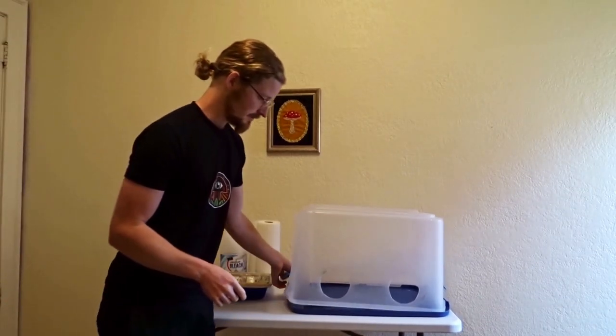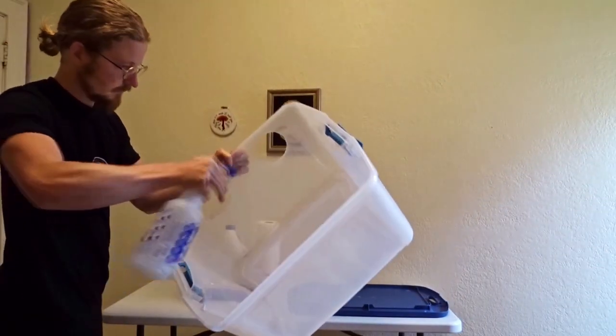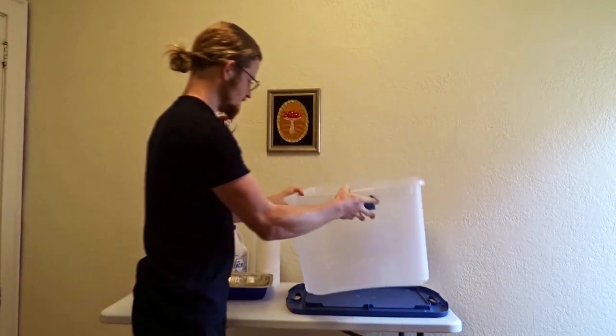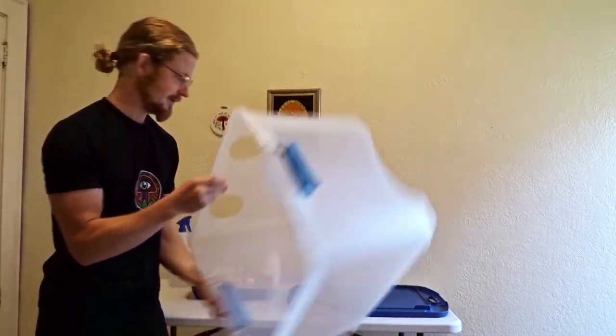Next, take your Still Air Box and spray it with your alcohol, wipe it down, or let it air dry. Take your paper towel, wipe it down — voila, it's dry. Do the same with the towel; I did it earlier, I'm not going to do it again.